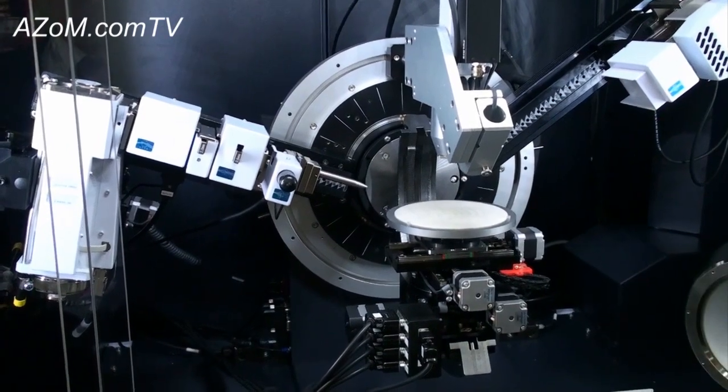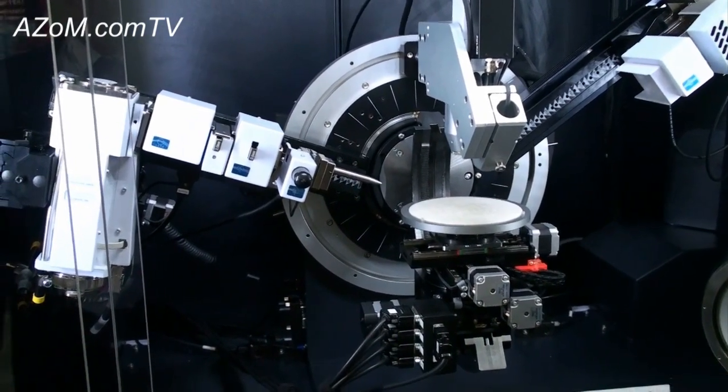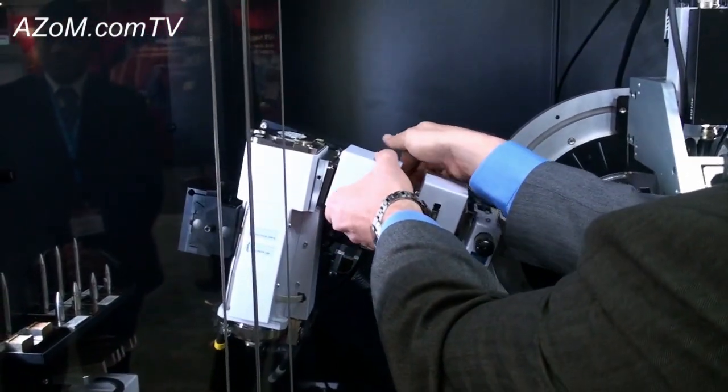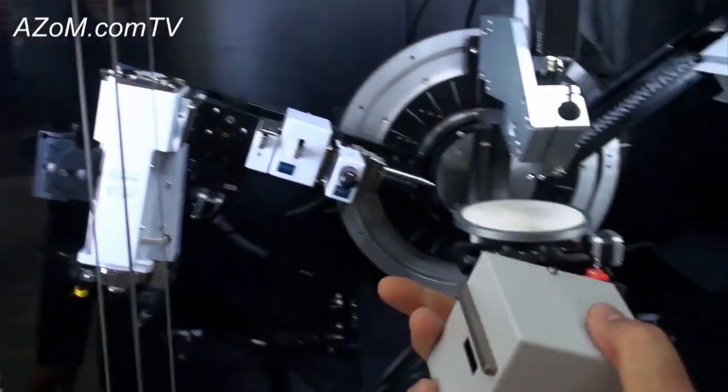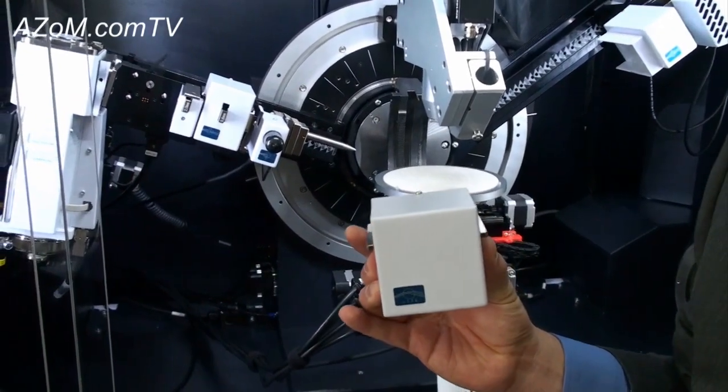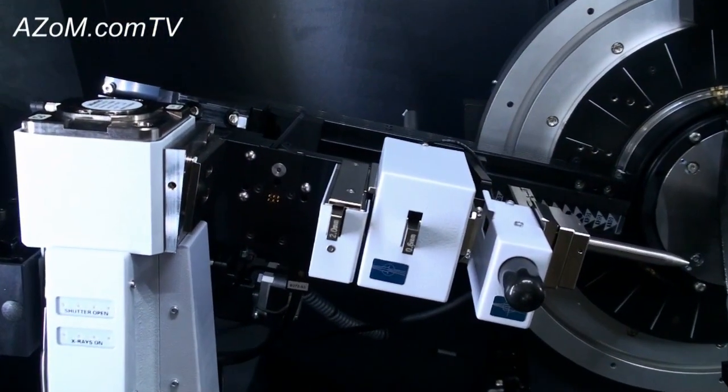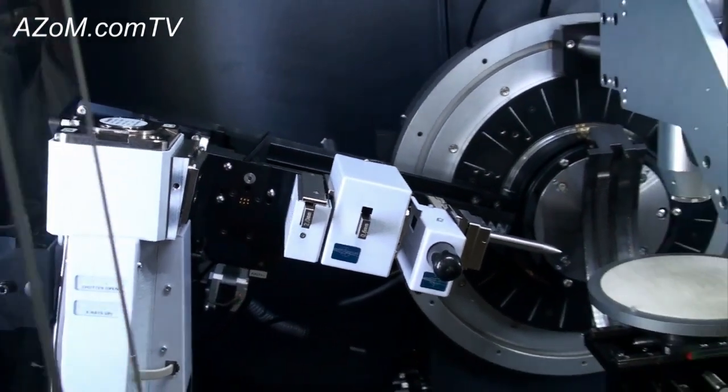We've done that with this system with our DaVinci and SnapLock components. The ability to easily take a component on or off the system with zero tools and zero alignment is ideal for any applications laboratory within a university or industrial environment.